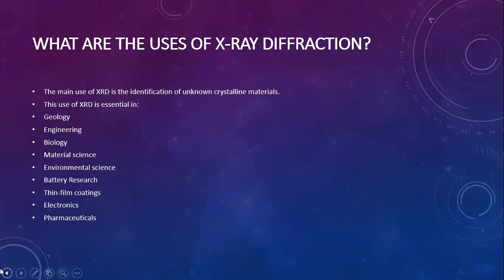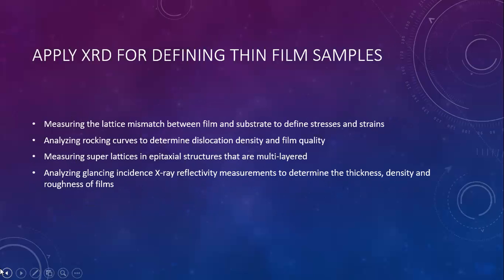So what are the uses of X-ray diffraction? The main use of X-ray diffraction is to identify unknown crystalline material. XRD is essential in geology, engineering, biology, materials science, environmental science, battery research, thin film coating, electronics, and a lot of others.